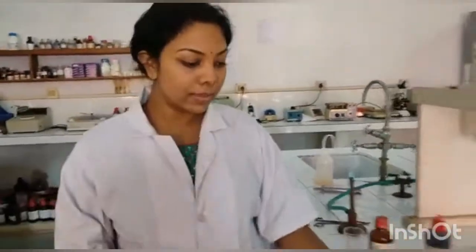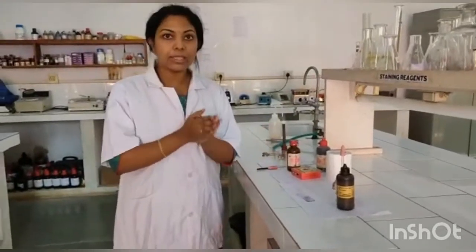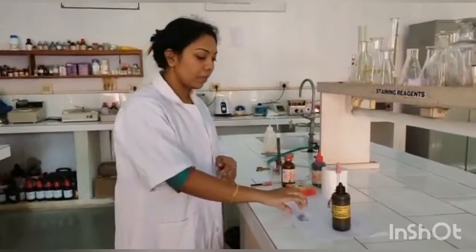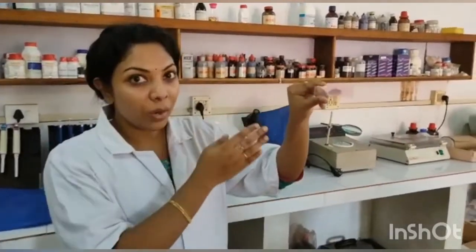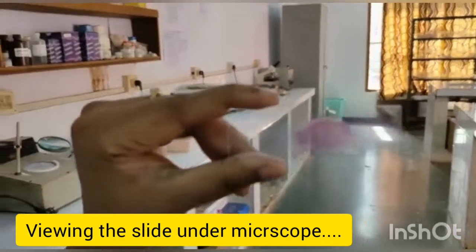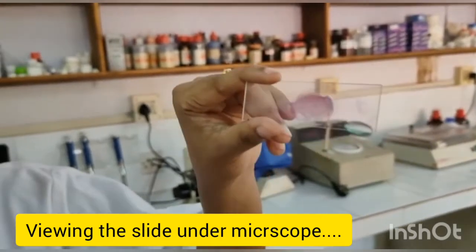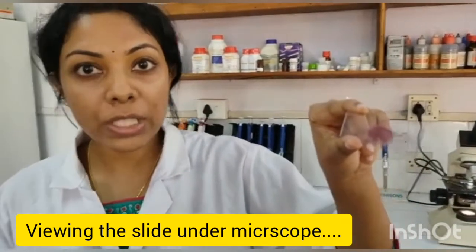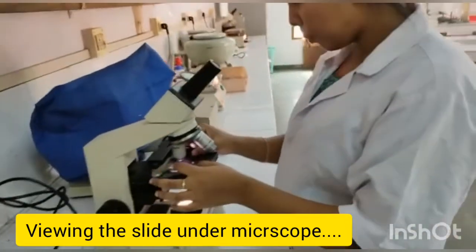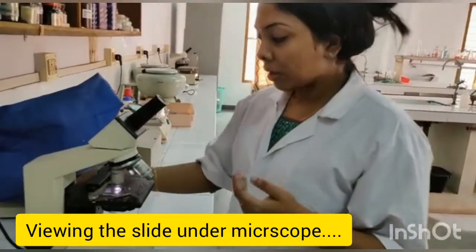Dry the slide. Keep the slide for drying. Just after the slide is dried, you can view it under the microscope. This is how the dried gram stain smear appears after the staining. Now the step is to view it under the microscope to distinguish whether it's gram positive or gram negative. We have the microscope here. I've already discussed the different parts of the microscope with you. So now we'll focus it.